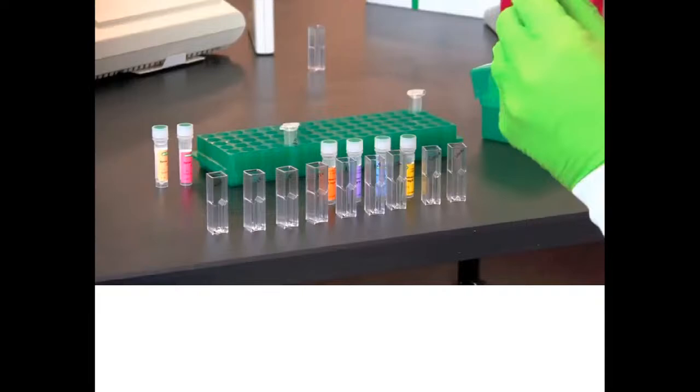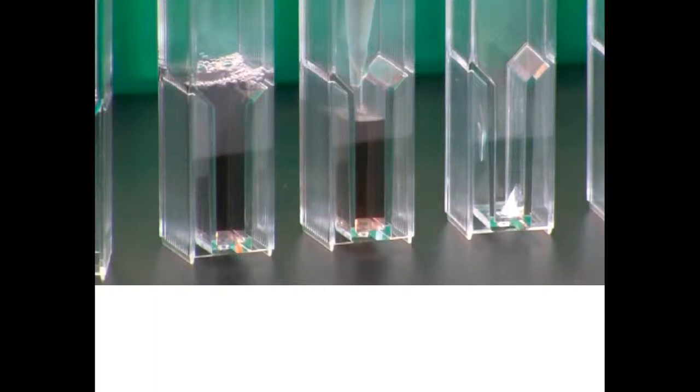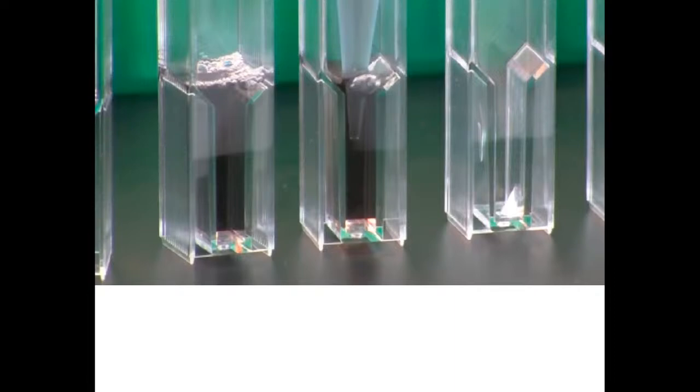Now you are ready to add the Bradford reagent to all of the cuvettes you have prepared, including the sample and control. Add 1 milliliter of 1x Bradford reagent to each of the cuvettes. Mix completely by pipetting up and down with the micropipette. Incubate the cuvettes at room temperature for 5 minutes.